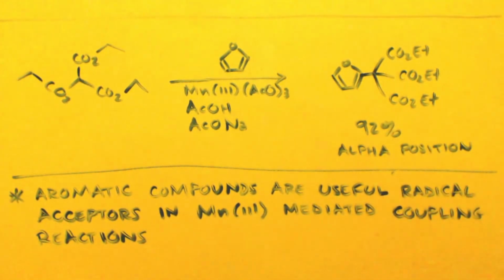You won't get that kind of yield with benzene and acetone, I don't think. I think you'll get more like a 30 to 40% yield. But this is why I believe that it could work. Keep in mind, benzene reacts with radicals all the time in reactions, you know what I mean? Like chlorination of benzene, you make a free radical chlorine.